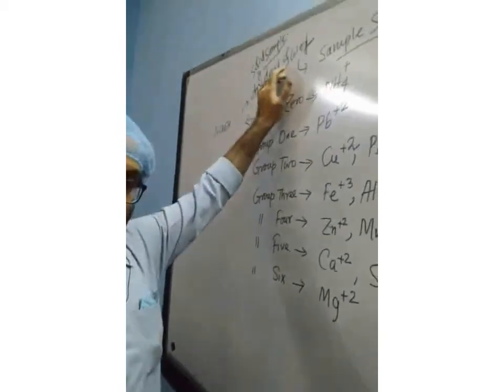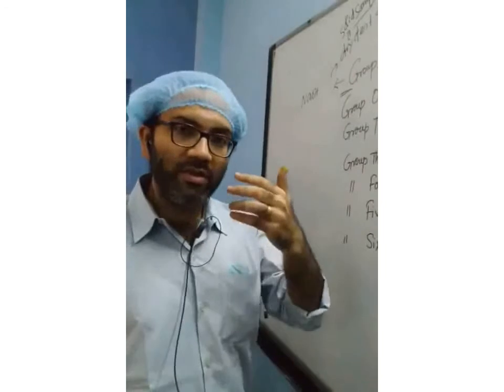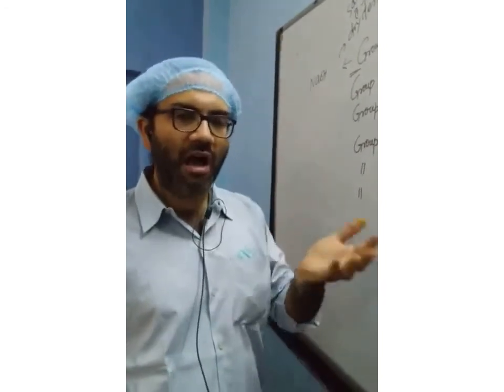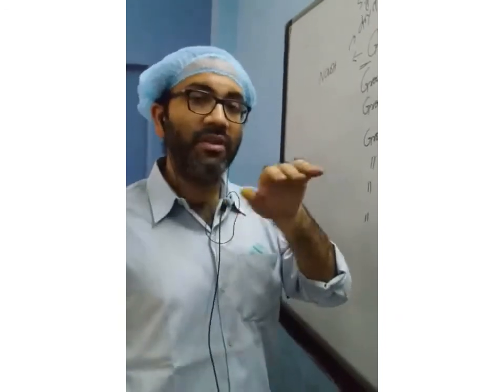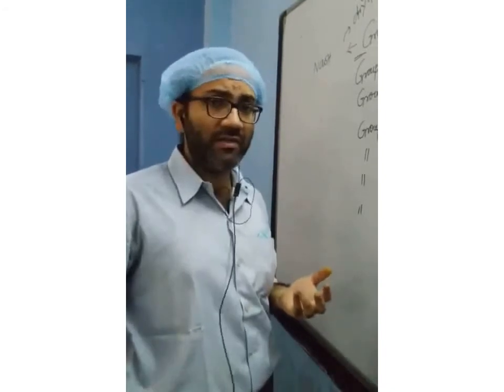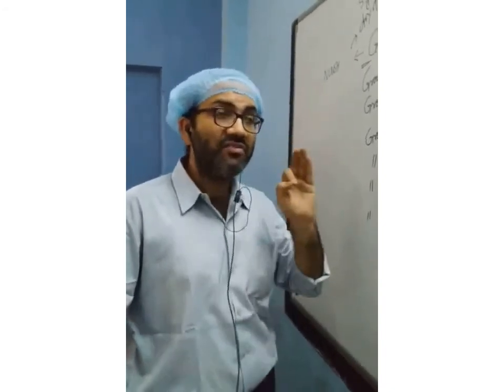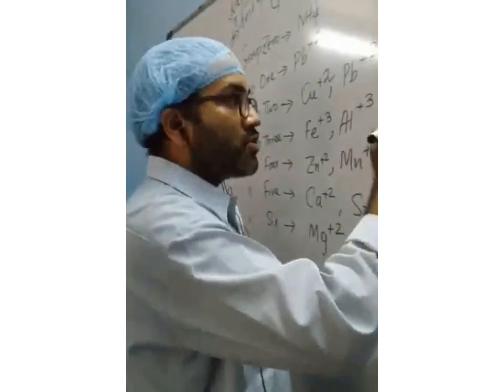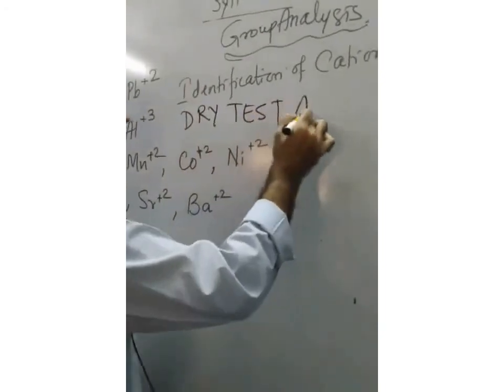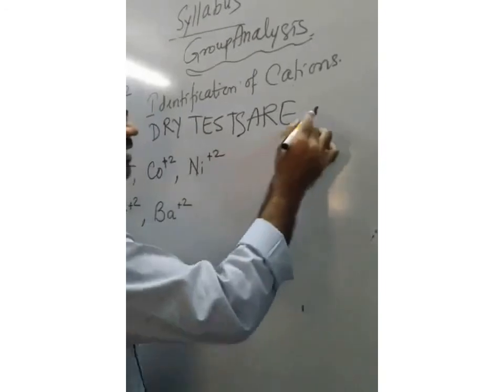From a dry test, using the solid sample, we will heat it, or we can use some acids, and from whatever results we get, we can get a preliminary idea of what cations are present. But we cannot confirm that. Dry tests are never considered to be confirmatory tests. Remember this.